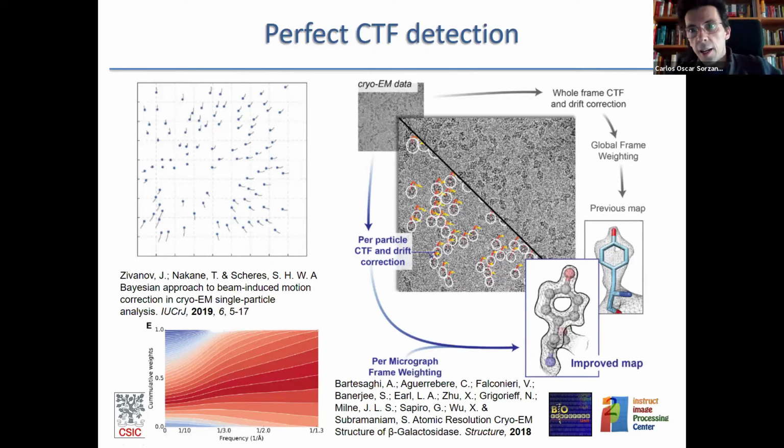But again, these algorithms, these are the Bayesian polishing and all this stuff, at the end they are also very, very unstable, because you are trying to fine tune some parameters, and you are having a lot of noise, and then the estimation of these parameters is rather difficult. And again, you need several algorithms to compare the estimates of each one of them.